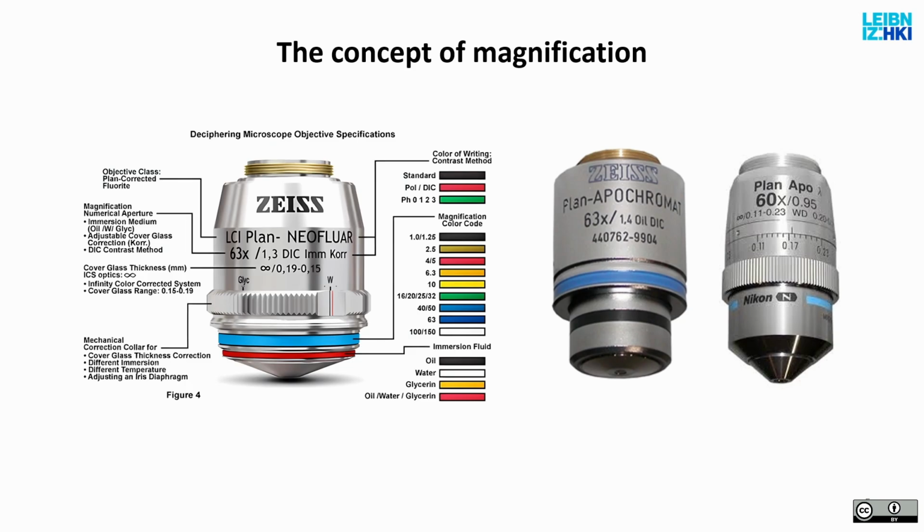One of you asked if this is the serial number. Yes, it is the serial number. So you can look this up in the catalog and it will tell you what exactly the lens is like, or how to characterize, for example, the transmission curve, point spread function, and so on and so forth.